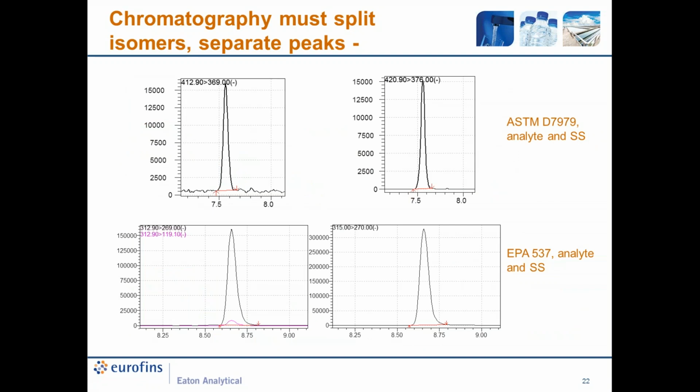These are analytes and labeled isotopes with about the same shape, and this is how they should look when you quantitate your samples.